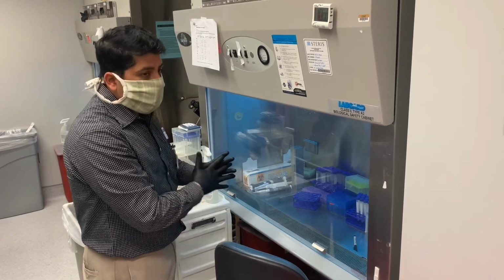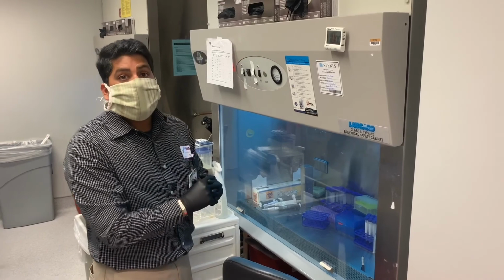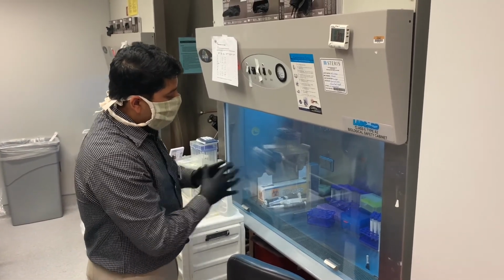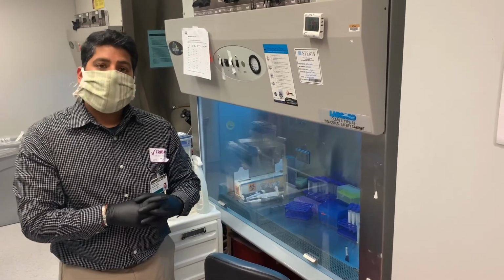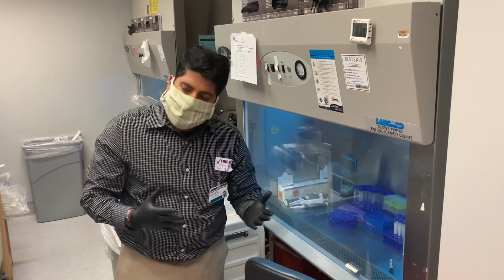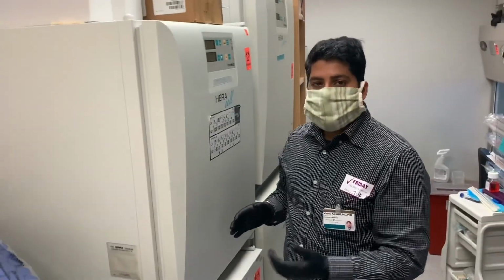And when we're not working with the cells, we make sure that these hoods stay sterile and decontaminate them with the UV light, which is why you see that the inside of the hood appears blue right now. Well, when we're not working with the cells in the hood, where do they live? Well, come on over and let's take a look at one of the incubators where we keep our cells.